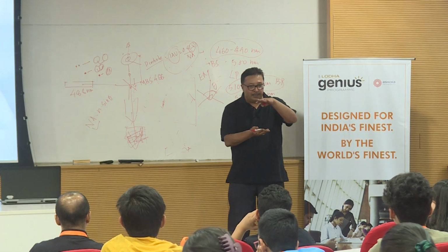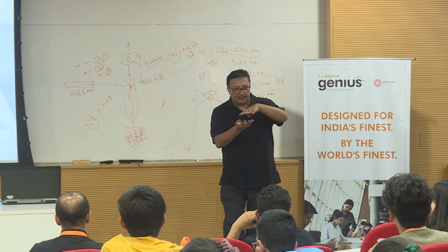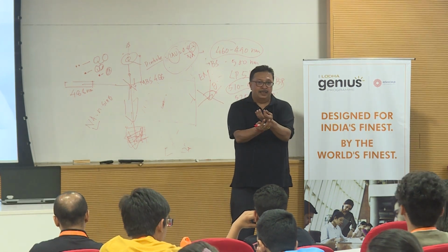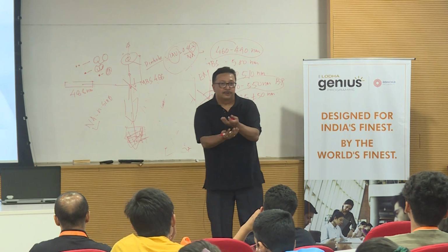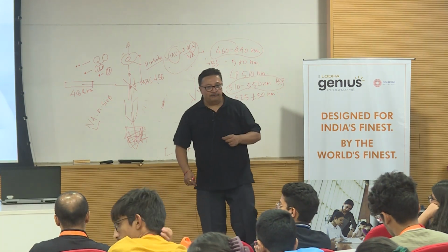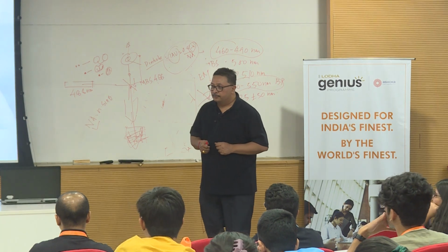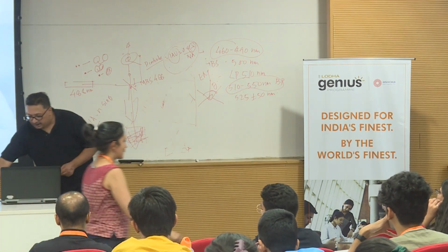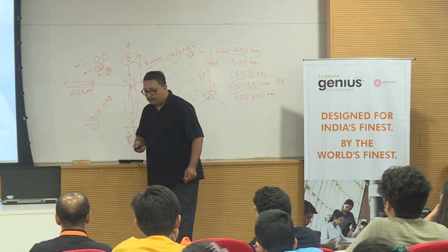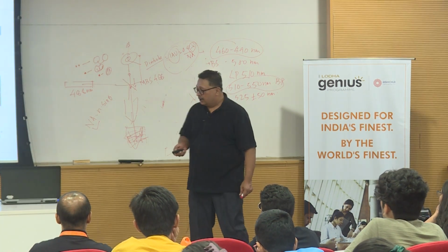And when you combine all these 2D images at different Z positions into one, you can create volumetric data, what you call a 3D resolved structure, or a 3D structure, totally in focus over the whole field of view. Okay, so let's go a little bit further. I think you are well acquainted with this now.